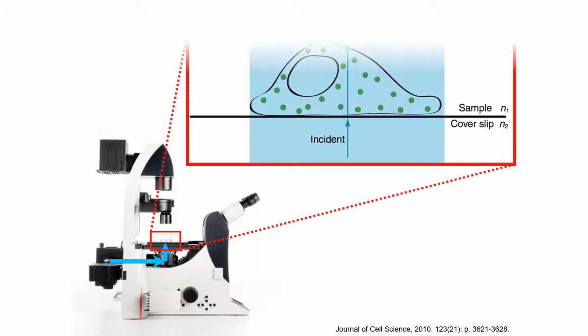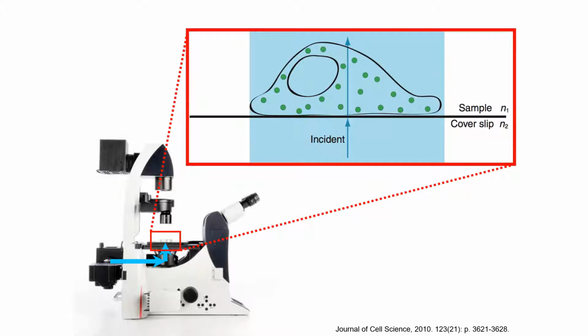An analogous situation occurs when we look at cellular cultures with the wide-field epifluorescence microscope. Let's imagine that we have a culture of cells growing in a dish, and we go to observe these cells using our traditional fluorescence microscope. In these types of setups, a mercury-based or a xenon-based light source is used to illuminate the sample, and effectively, we end up blasting all of the specimen with light that passes through the entire cell volume.